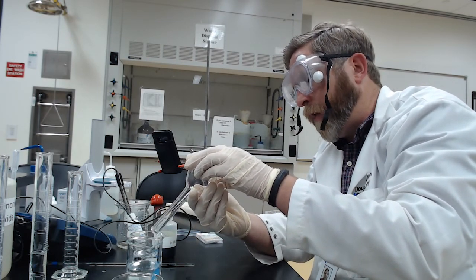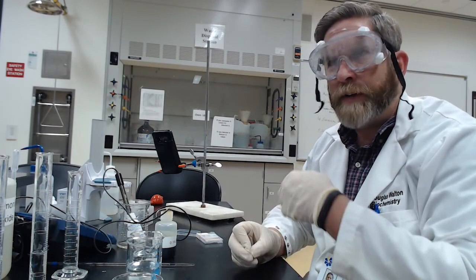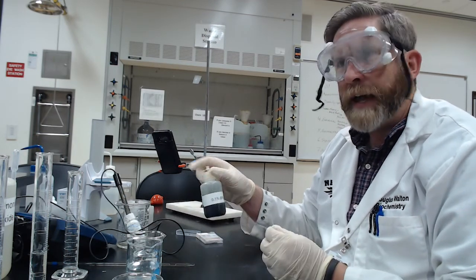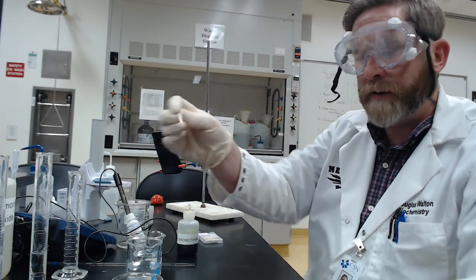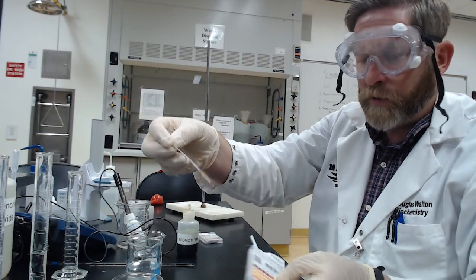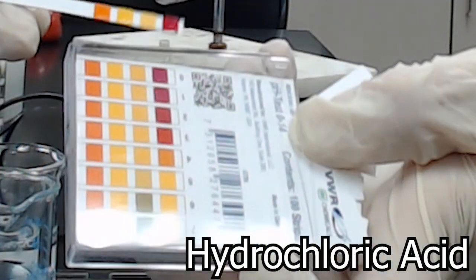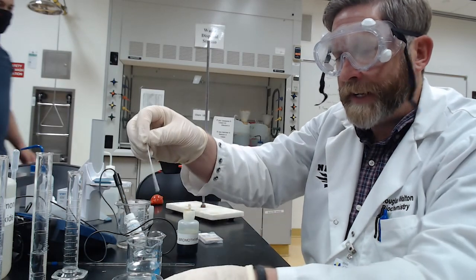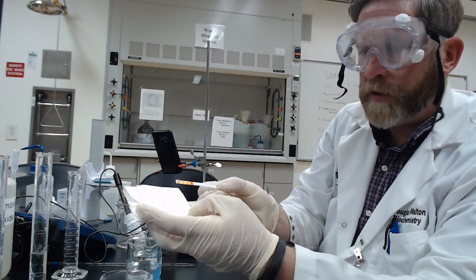In part A, we'll compare the quality of pH readings from pH paper versus the pH meter. I'll first measure all four solutions with pH paper, then with the meter. We'll also add bromothymol blue, an indicator that changes color based on pH. Make predictions before we do this. For hydrochloric acid, submerge all the indicator strips beneath the liquid and compare it to your master — a series of colored indicators — and give your best estimate.